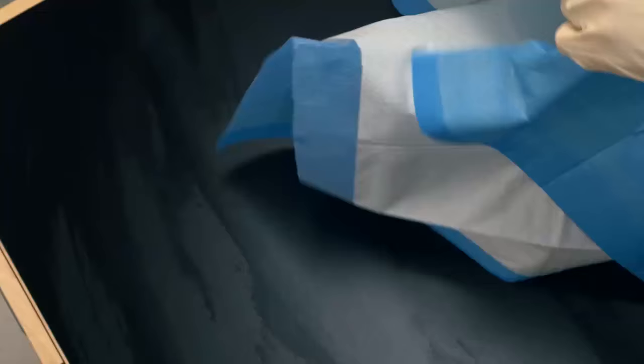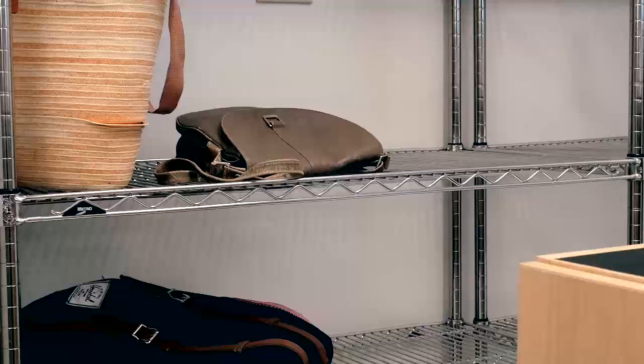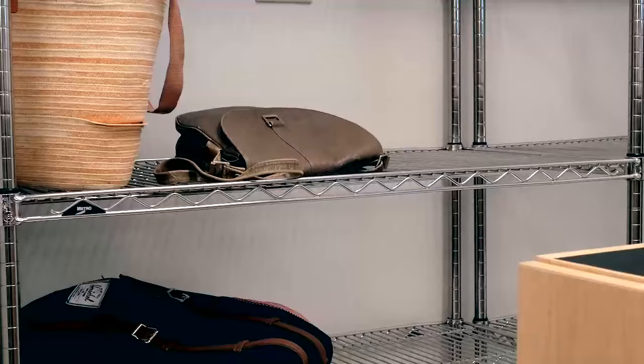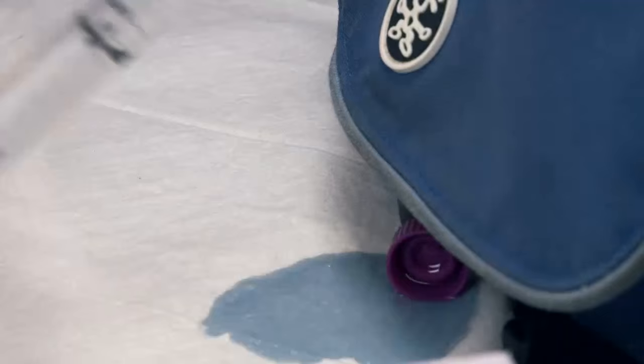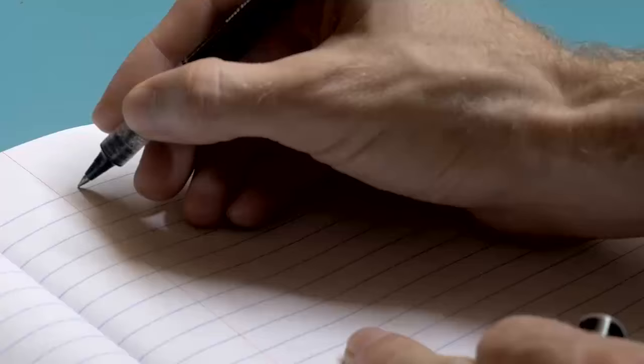Clean your bench at the beginning of lab and put down a benchtop cover. Keep your personal items and electronic devices in the assigned spaces. Never place personal items on benchtops. Spills do occasionally happen in the lab, so keep your notebooks on a different bench.